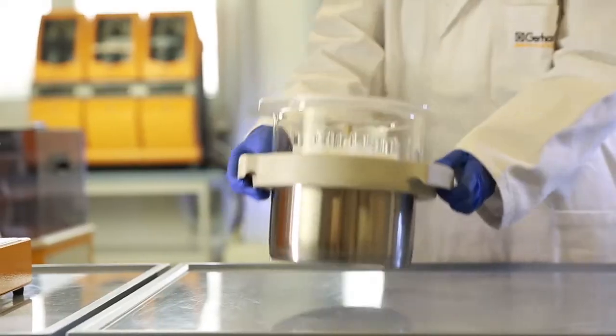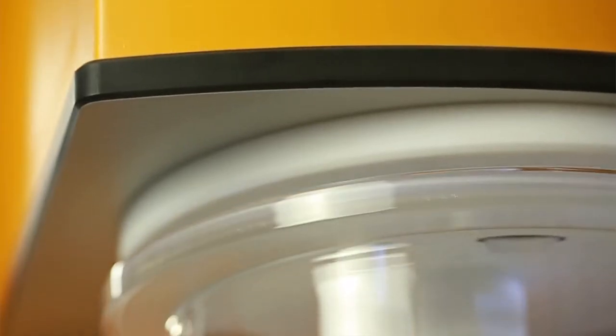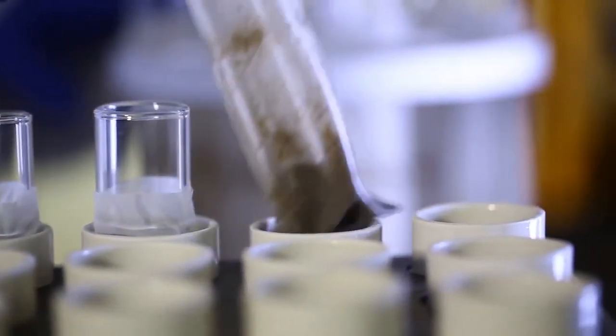The device is straightforward to use. Simply insert the sample carousel, select the method, and press start. The incineration module also makes usage easier.